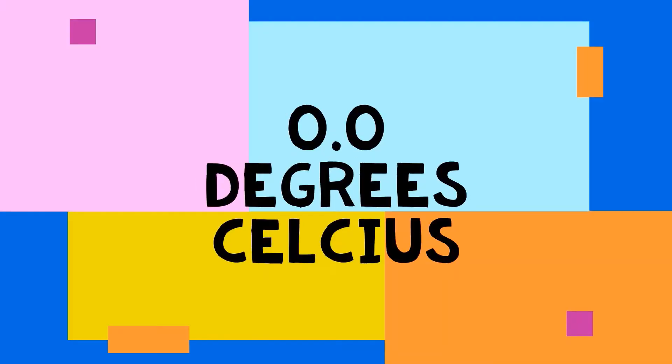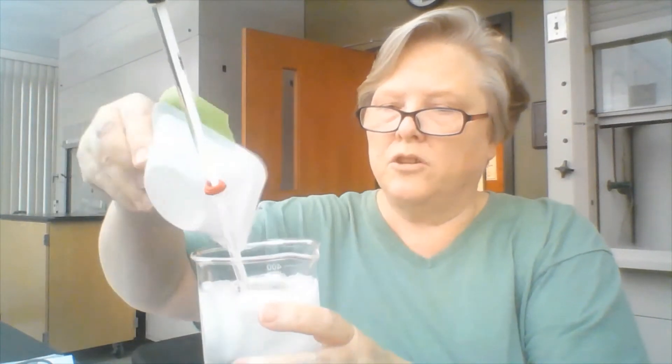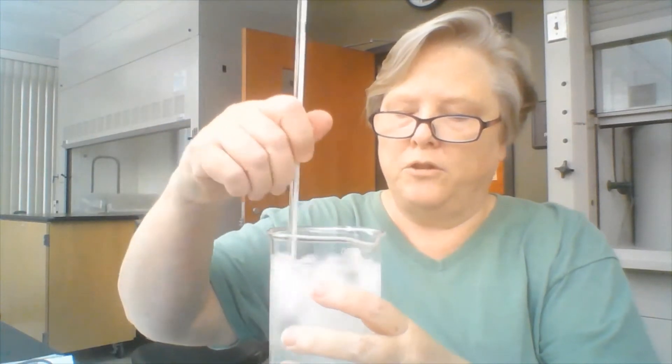Now we're going to add a little bit of salt to the water, and we're going to add five grams of sodium chloride to it. Here's my five grams of sodium chloride in my weigh boat, and I'm going to add that to my beaker full of ice water, and stir until it's dissolved, and then we'll read the temperature of that.